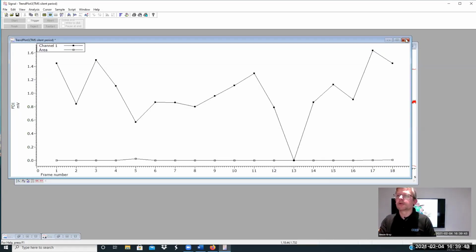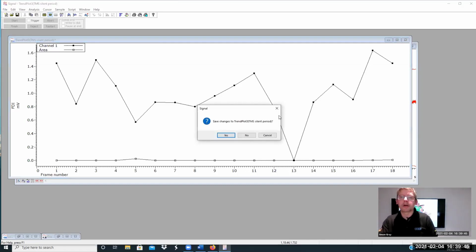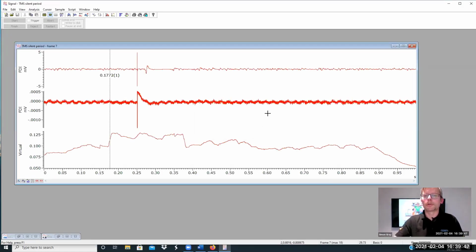Right, I'm sure that's not quite what you mean, though. You'd rather get that it is output to the grid document directly. And for that, I would use a script. Simply, as the measurements are taken, you would use the row as the frame number, and then you would increment across through the columns where you'd like to paste or print the output.